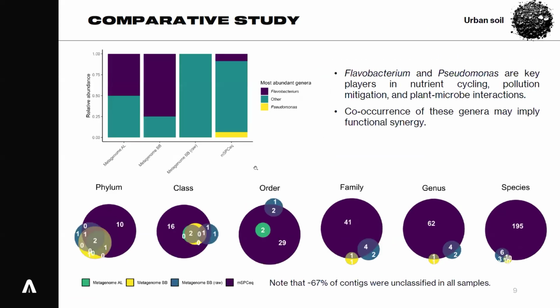In the soil sample, the pattern was very similar. Again, a big chunk of contigs were not classified, but among classifiable contigs, we again obtained a broader taxonomic diversity in single cell samples. And again, among those organisms that we were able to detect, from the biological and ecological perspective, the results made perfect sense.